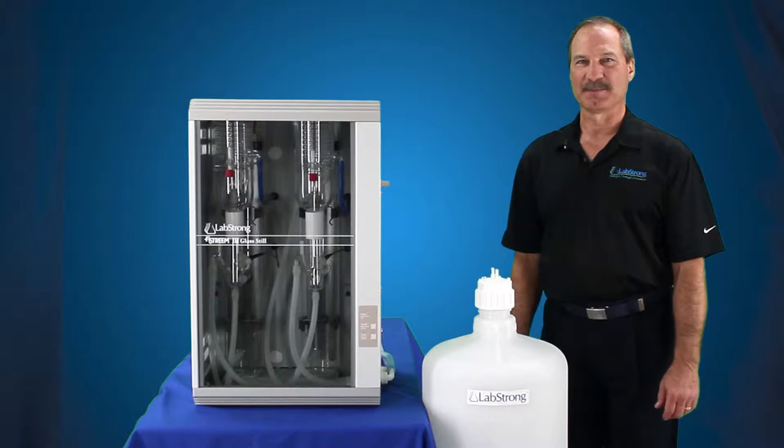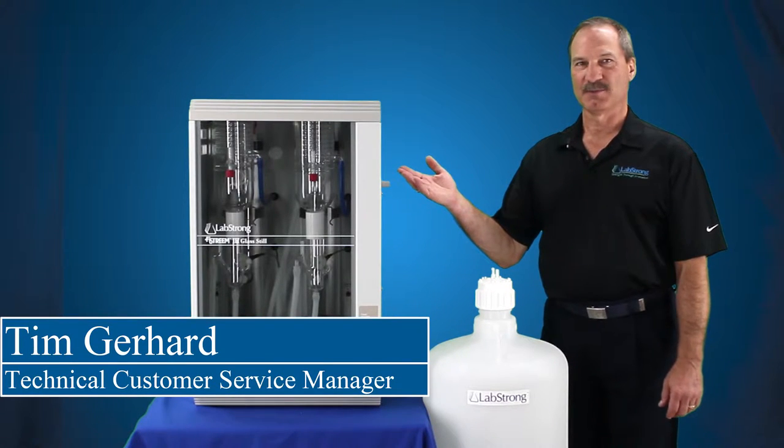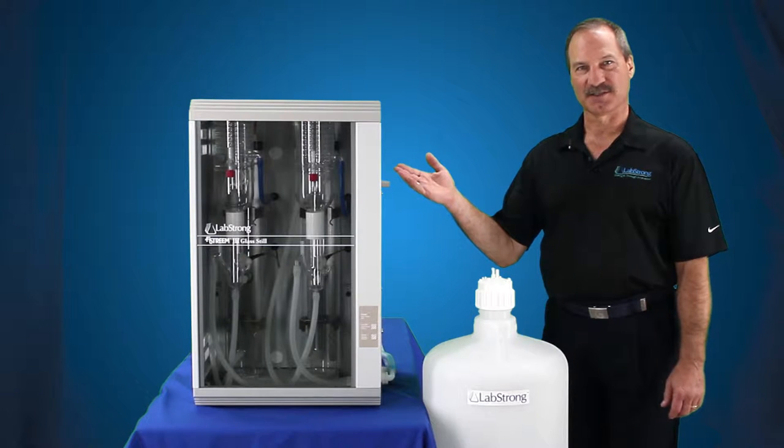Hello, my name is Tim Gearhart and I'm from LabStrong. Today we're going to connect the 50 liter carboy to the FiStream 3 glass distillation system.